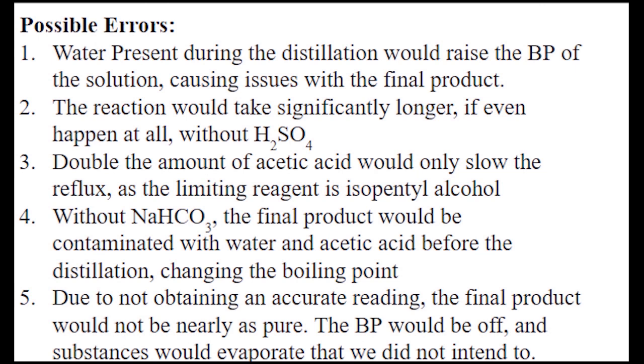If water was present during the distillation, the boiling point for the solution would be thrown off and the final product would be contaminated. If sulfuric acid was not added, the reaction would likely take much longer to occur, if even occur at all. Doubling the amount of acetic acid would slow the reflux reaction as it is already in excess. Adding more would only slow it further. If you forgot to use sodium bicarbonate, the final product would likely be contaminated with water and acetic acid. If the thermometer was not pushed down all the way, the temperature for the distillation would be off and the product would not be as pure.